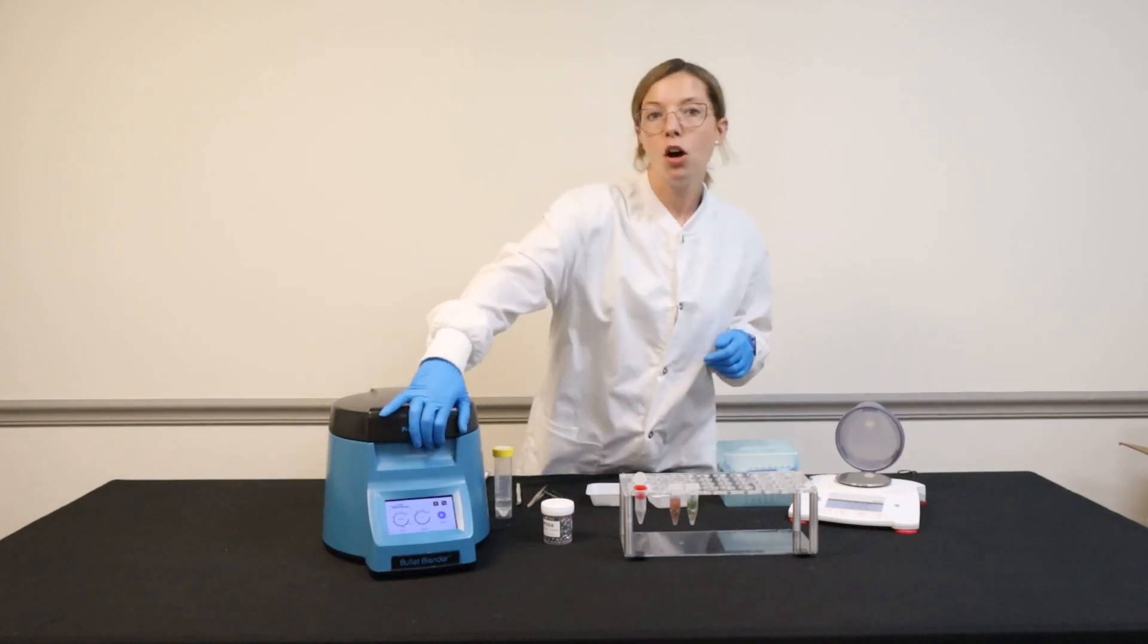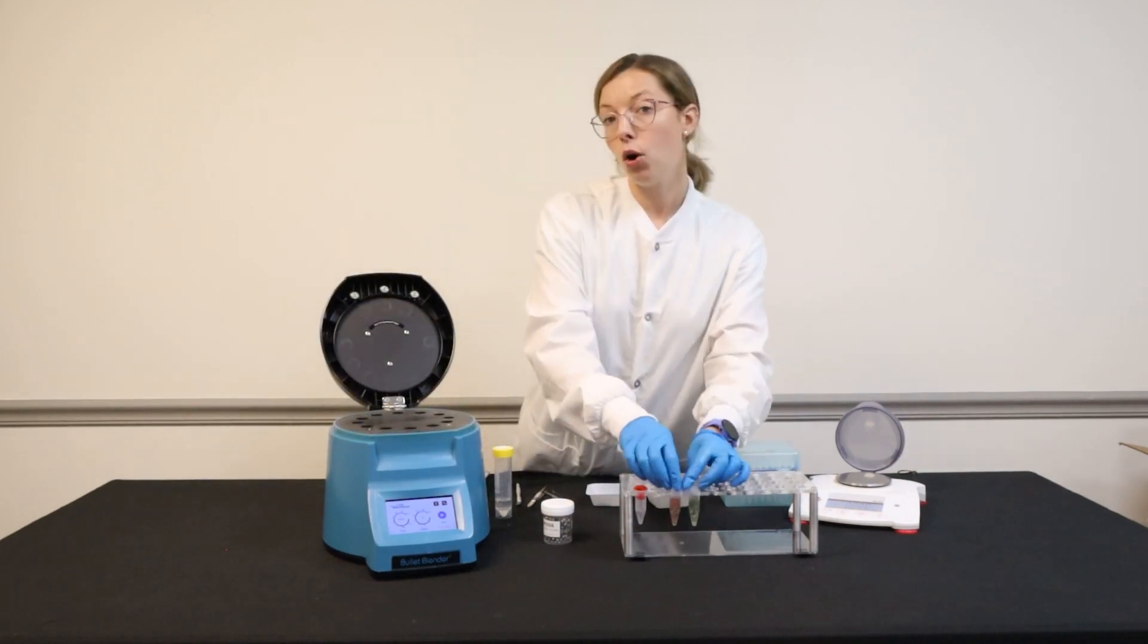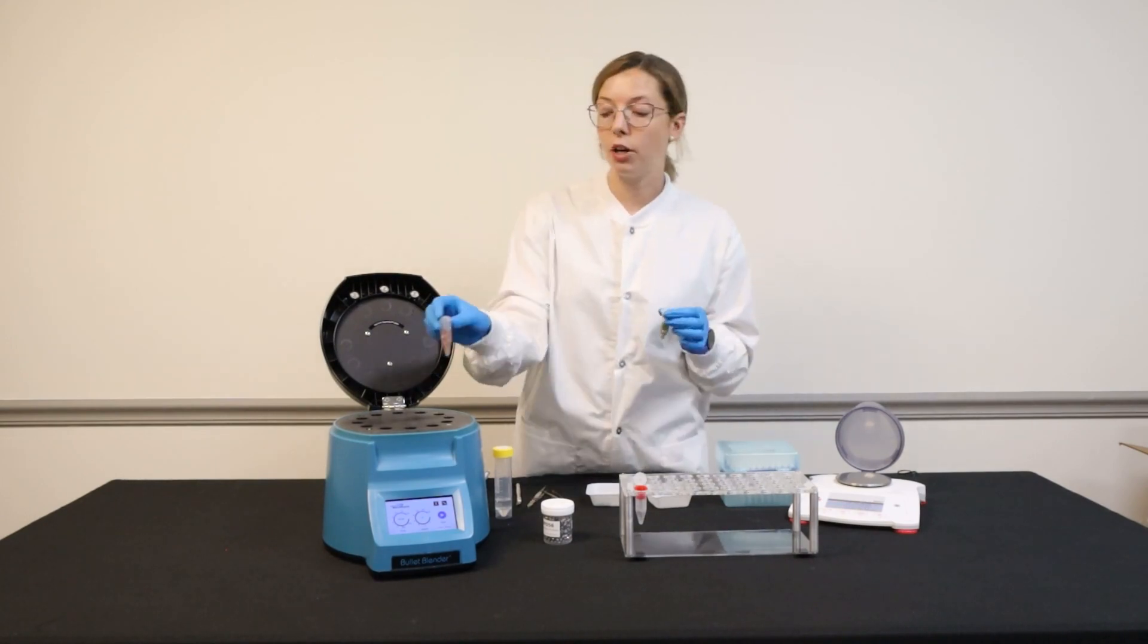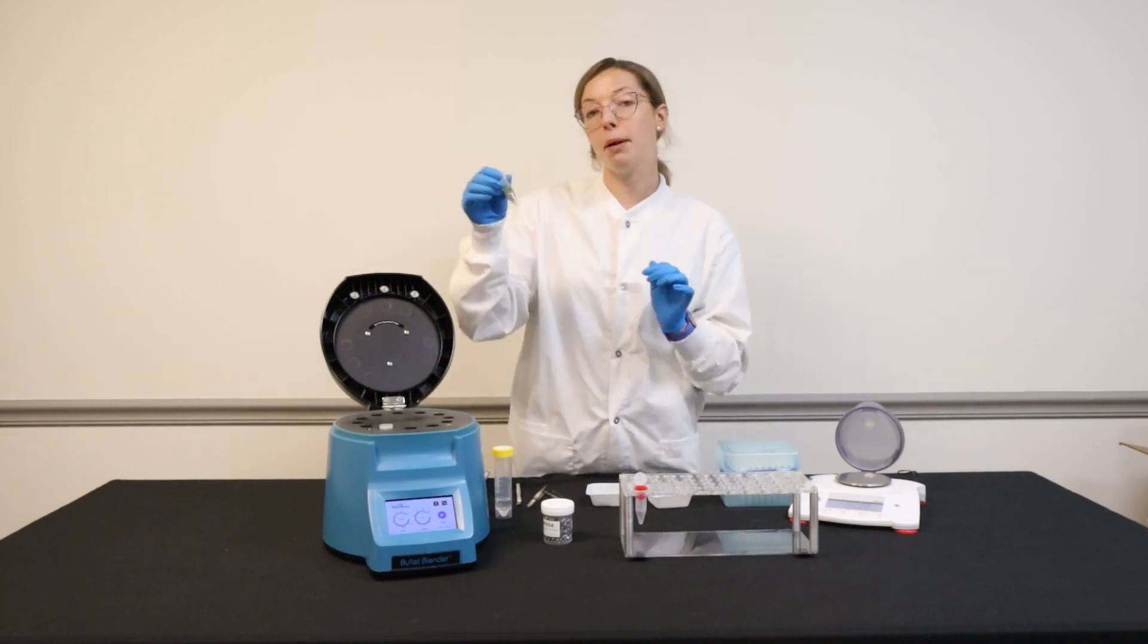Once your tubes are ready to go, we're going to load them into our 5E Bullet Blender. Unlike a centrifuge, you don't have to worry about balancing your tubes, so I'm going to place both of my samples up front.